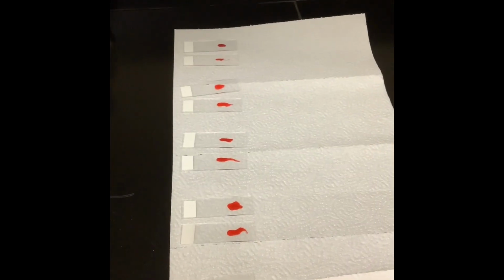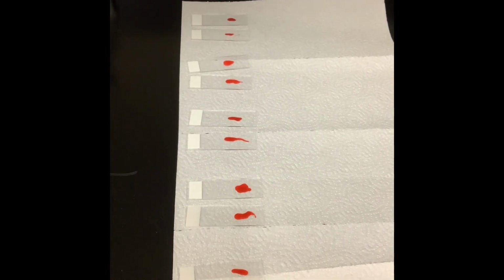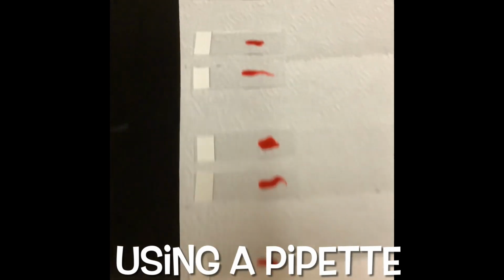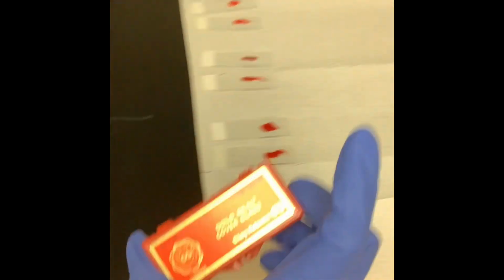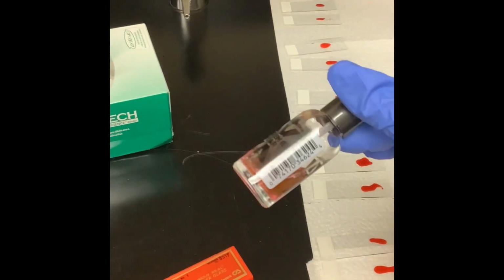So after the pollen has been stained and you've centrifuged all your samples, you can go ahead and draw up your whole sample and then split it in between 2 slides, as I've done here. And then you're just going to add a cover slip on top of each of those. Add it carefully so that you don't get any air bubbles, or you minimize air bubbles. And then after they all have cover slips, you can go ahead and seal the slides with clear nail polish.